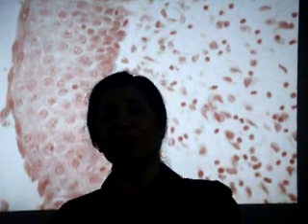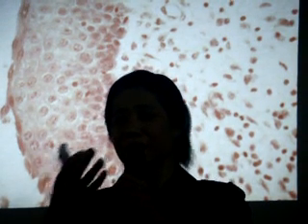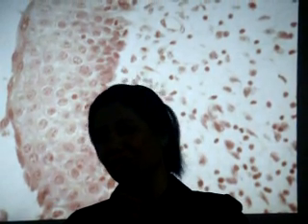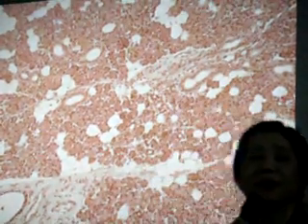Same banana. Okay? Higher magnification. So, pagka epithelium, you expect, okay, the specimen to be focused under high magnification. Classify whole structure according to the type of secretion. Okay, it's a serous gland, right?